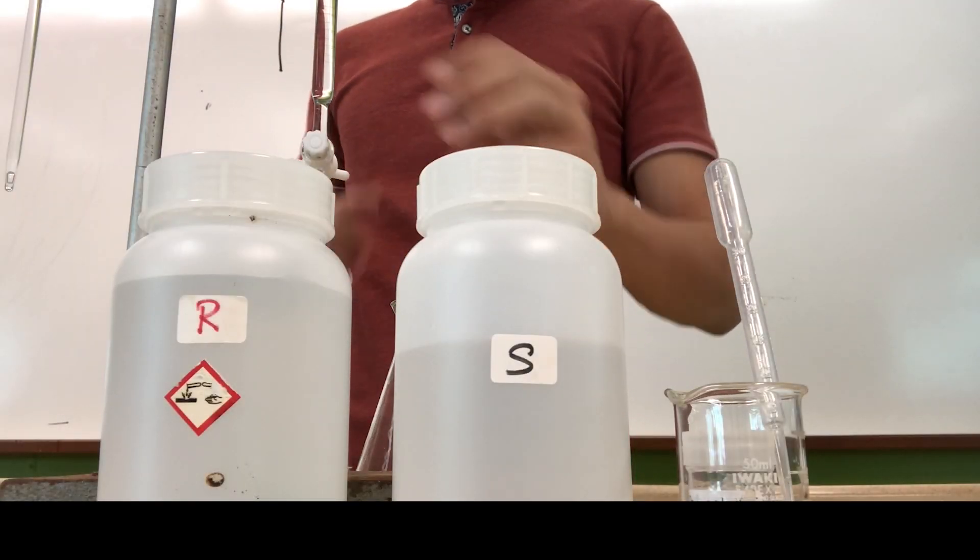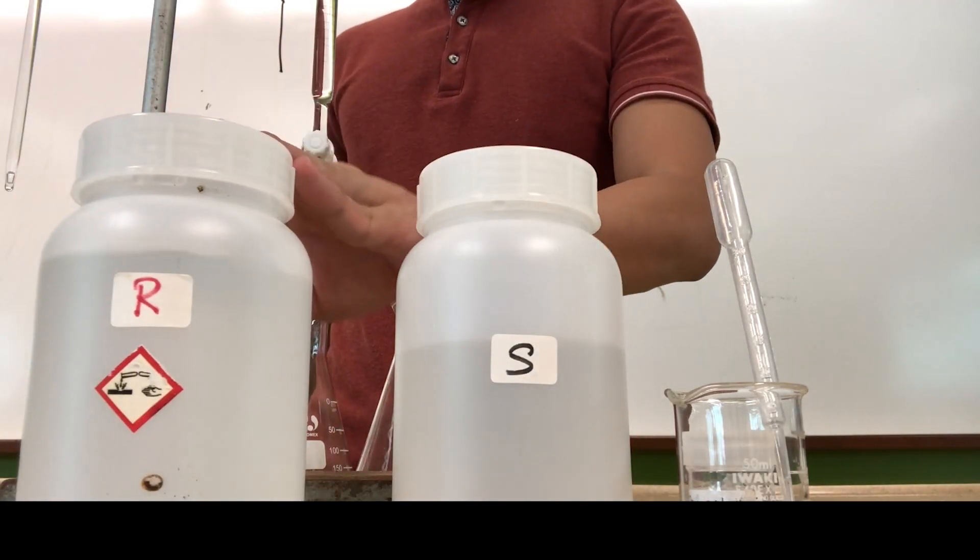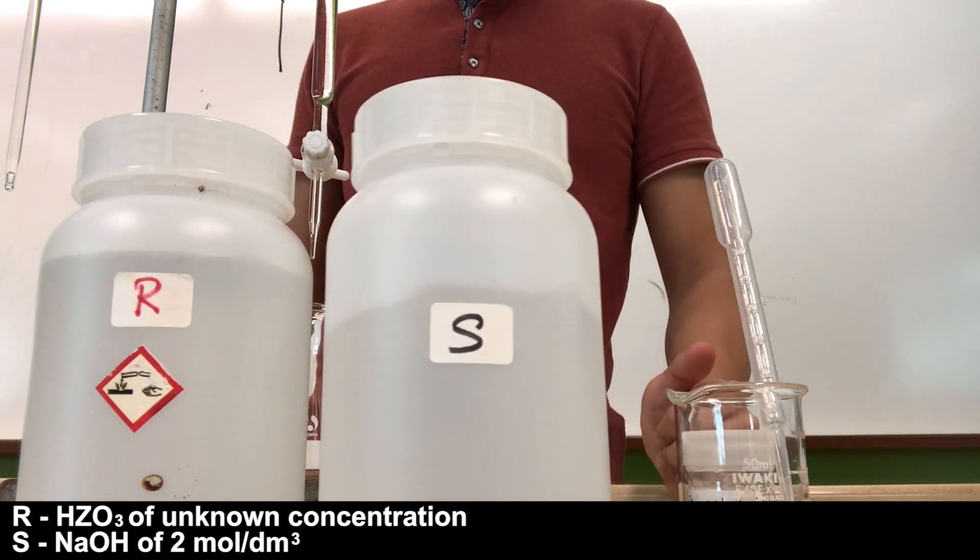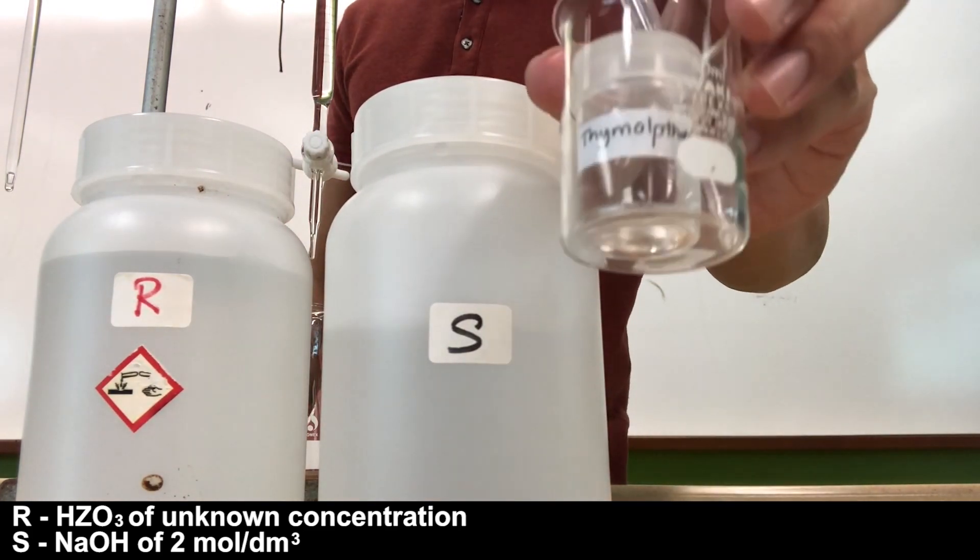Hi everyone, in this video we are going to take a look at titration. So over here I have two chemicals, R is an acid and S is an alkaline. And today we are going to use this indicator called thymolphthalein.